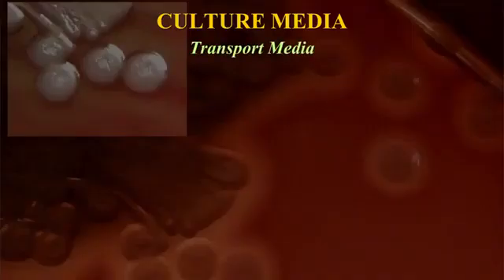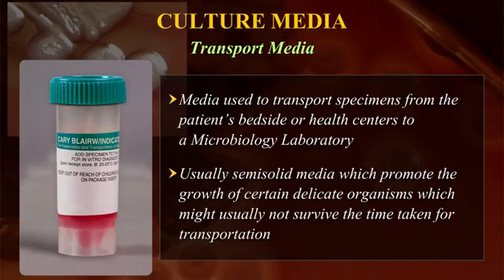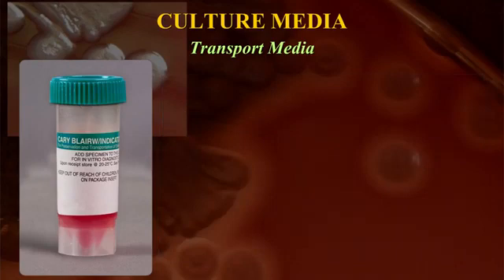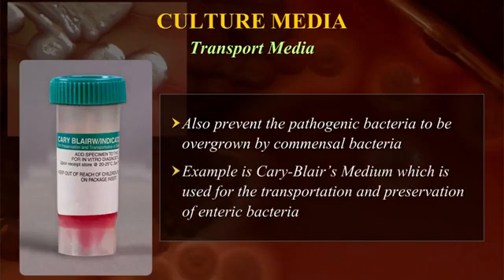Transport media. As the name indicates, these media are used to transport specimens from the patient's bedside or health centers to a microbiology laboratory. These are usually semi-solid media which promote the growth of certain delicate organisms which might usually not survive the time taken for transportation of the specimen to the laboratory. These also prevent the pathogenic bacteria from being overgrown by commensal bacteria. An example is Cary-Blair medium, which is used for the transportation and preservation of enteric bacteria.